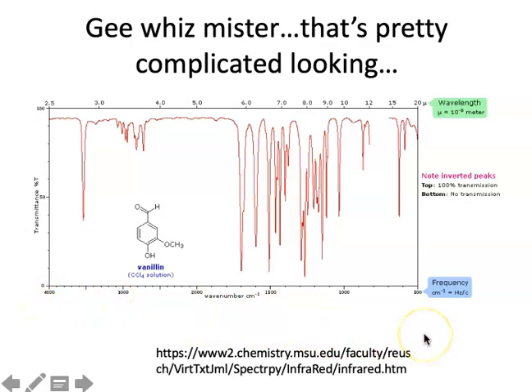One thing that's probably good to keep in mind is that the energy of these various molecular vibrations increases as we move to the left. So as you follow this arrow, hopefully you can see that arrow, energy is increasing in that direction. You'll notice this y-axis called percent transmittance, right? And that really does mean how much light is actually being let through a sample cell.